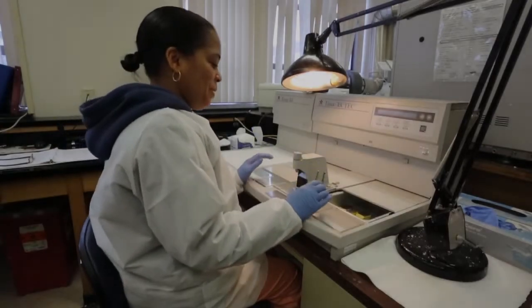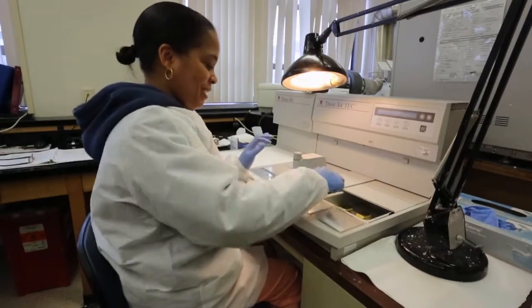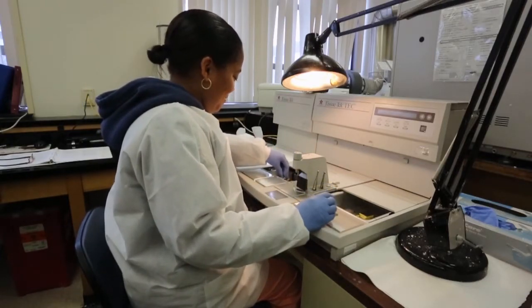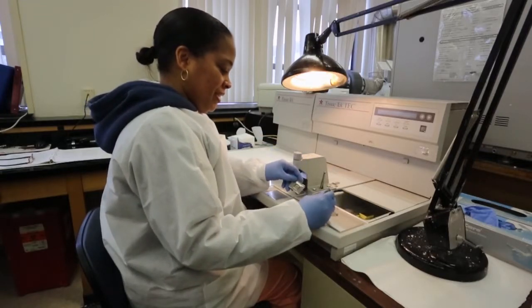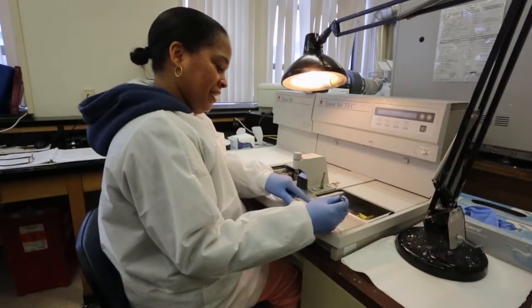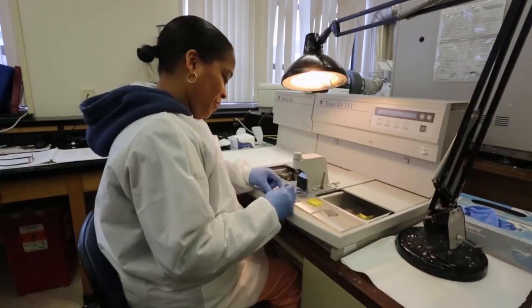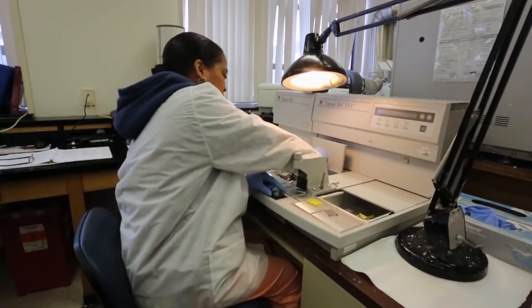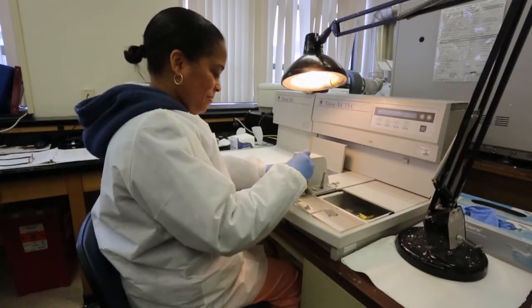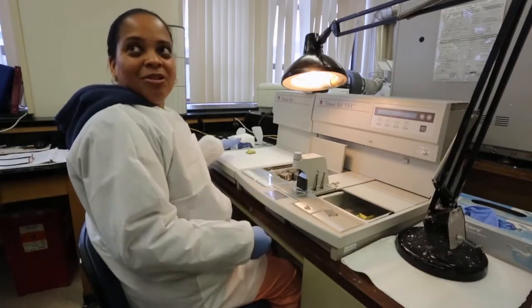This is the embedding center. This is where we're going to take the blocks from the processor — they'll get embedded with paraffin. I'm using the small mold because we only have one piece of tissue. This area here is hot and this is a little cold plate. You put the mold here with paraffin in it, put the tissue in there, and you can use this small tamper to press it down, then put the cassette on top. Put a little more paraffin in and move it over to the cold plate.